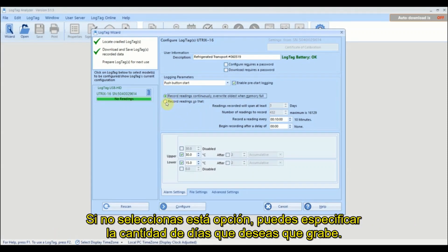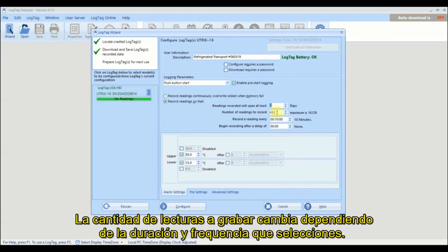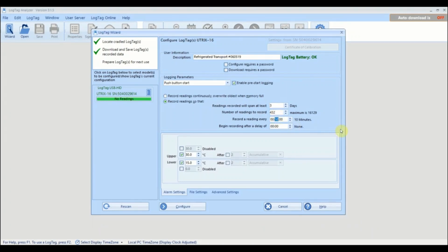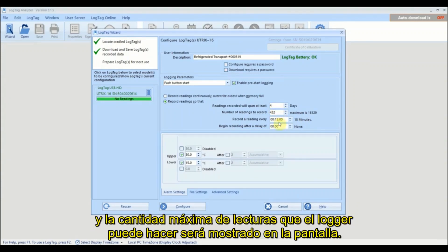If continuous recording is not selected, you can specify the number of days you wish to record for. The number of readings to record is adjusted according to the duration and frequency of your readings. Specify how often you want your logger to take a reading, and the maximum number of readings the logger can take will be displayed.